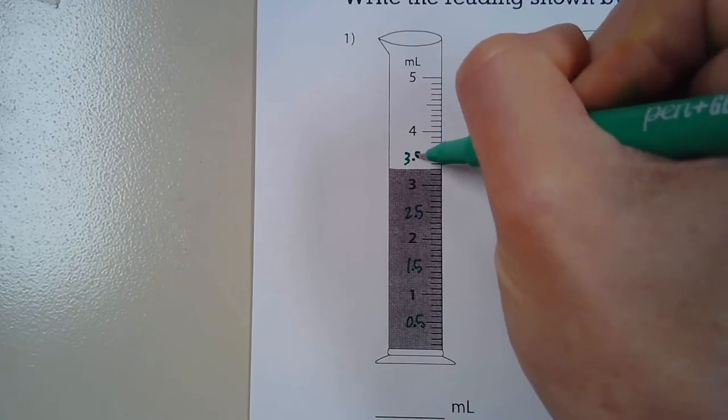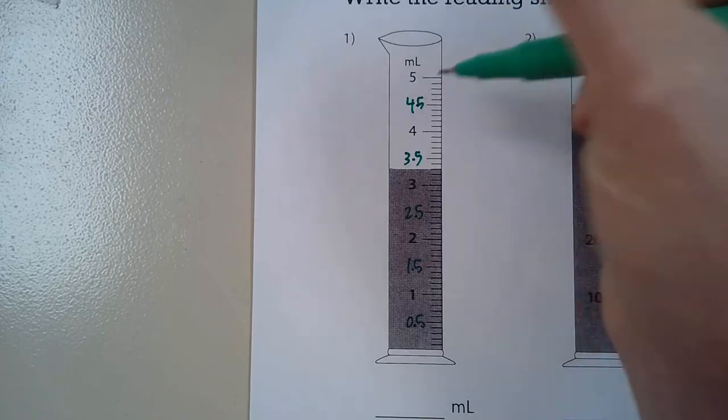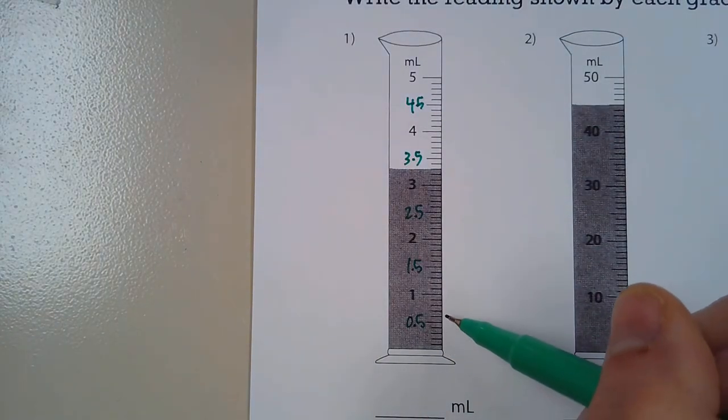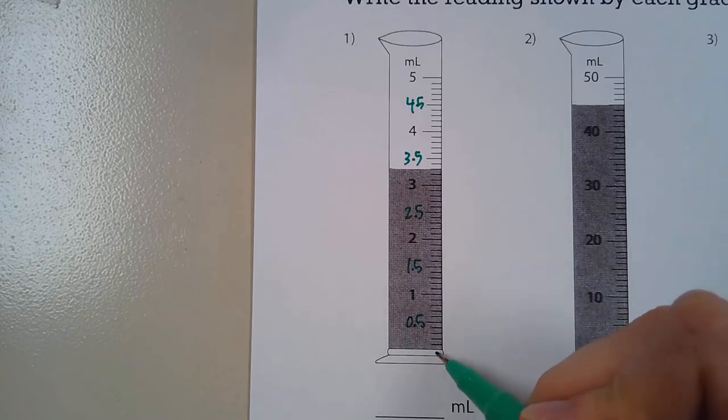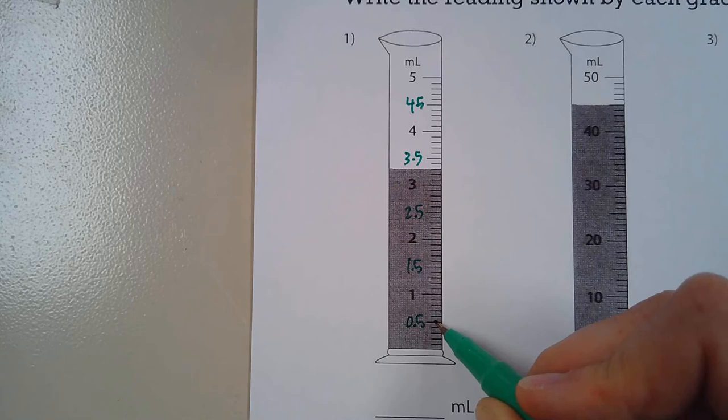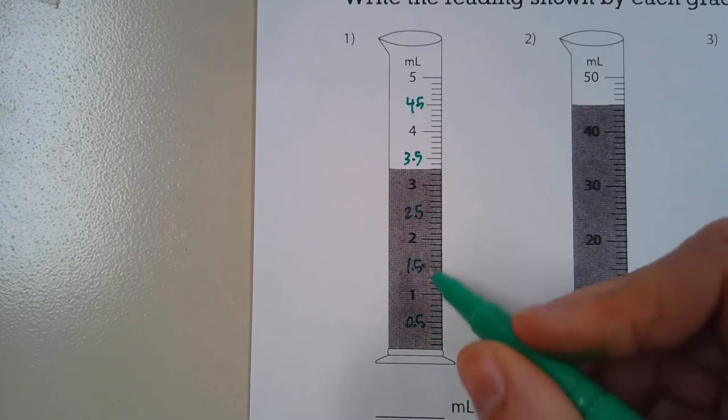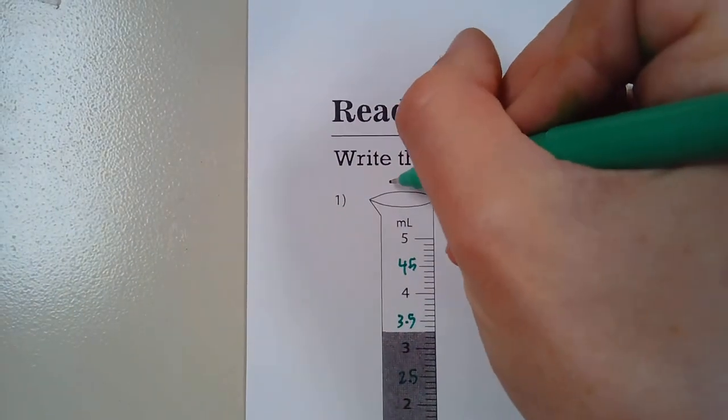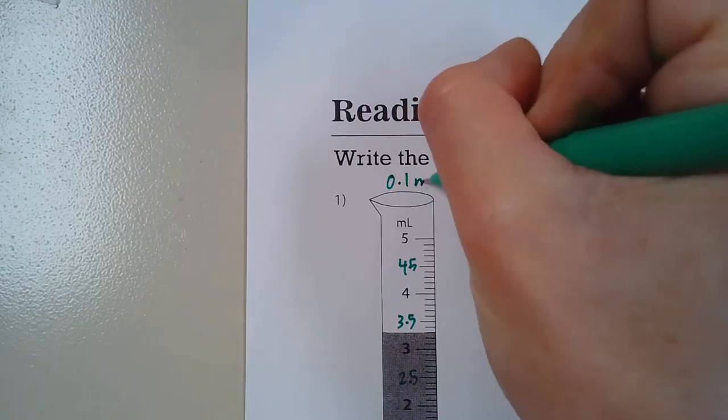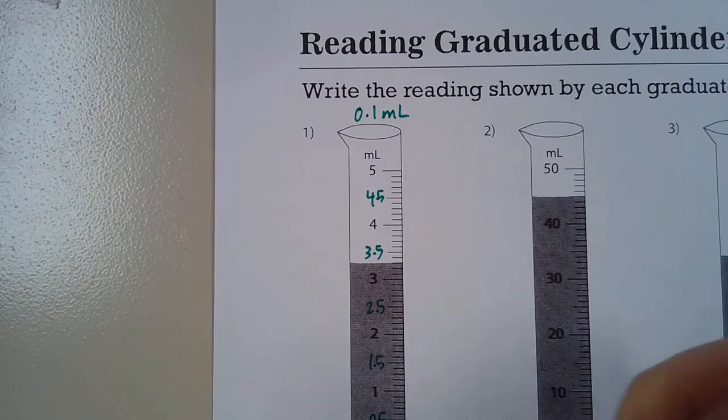So from the very bottom to this 0.5 we need to figure out, well what are these smallest lines counting by. So if they're counting by 0.1, 0.2, 0.3, 0.4, 0.5 that would be correct. So this particular one the scale is 0.1 milliliters.